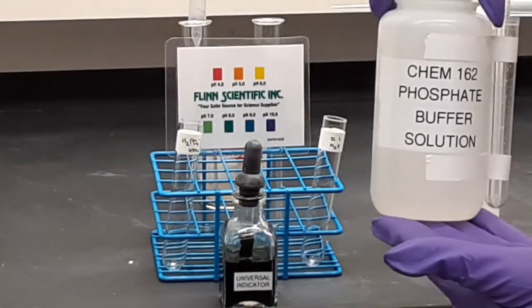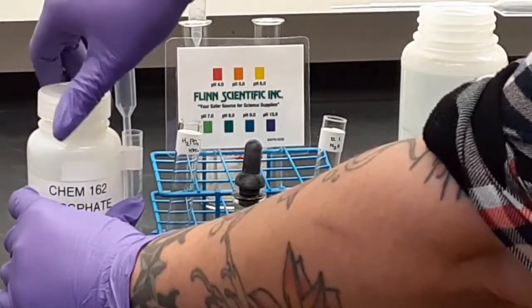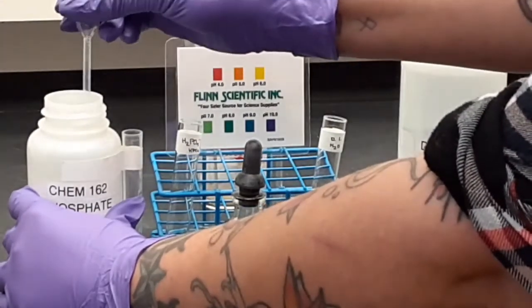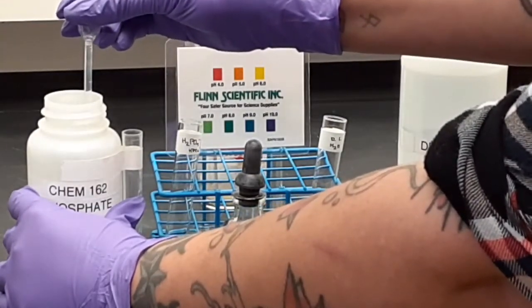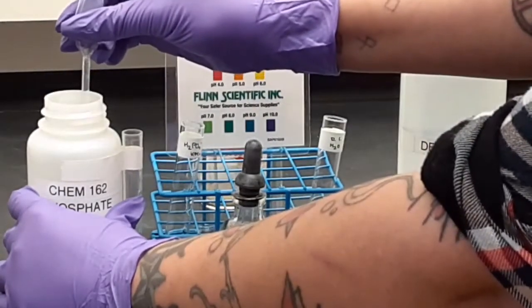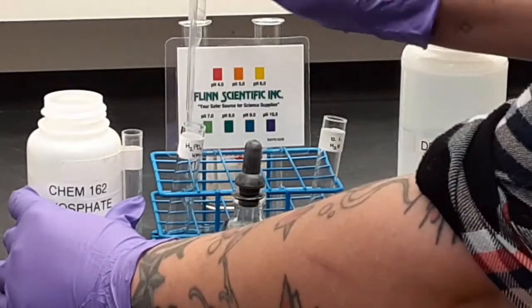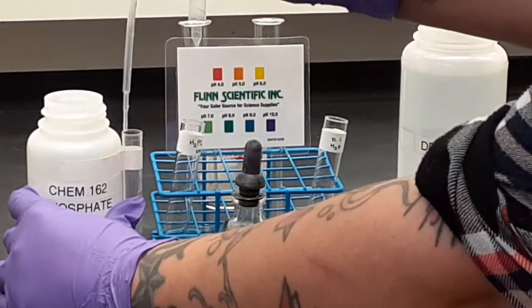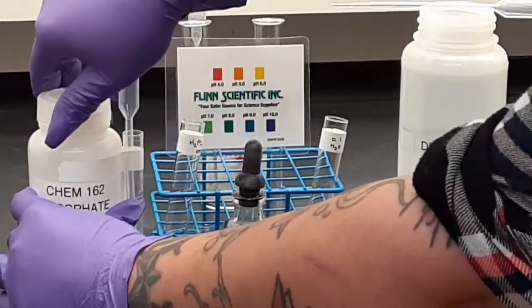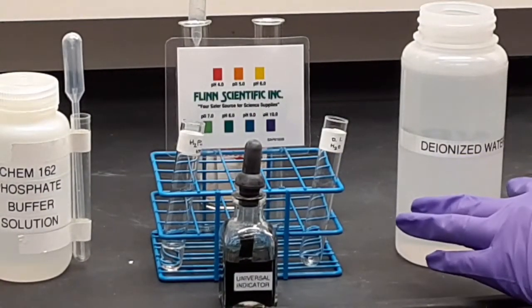So here's our buffer. Those two forms are in that bottle together. An approximate measure is good enough. Now as a comparison, water.